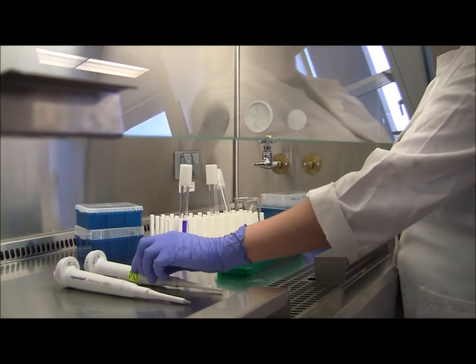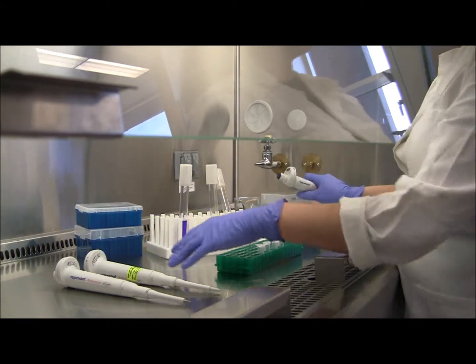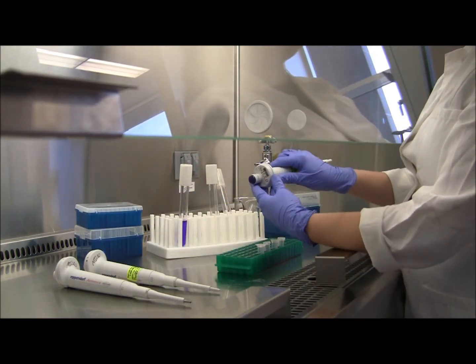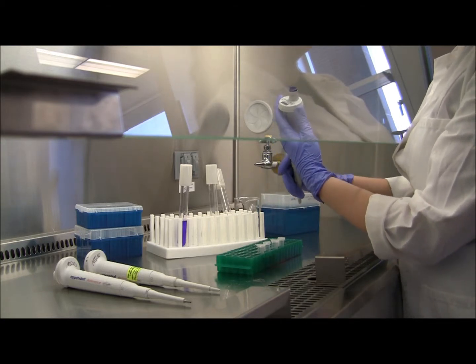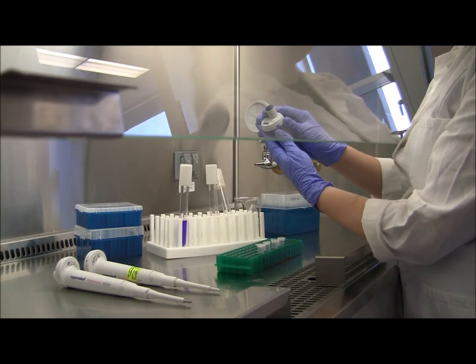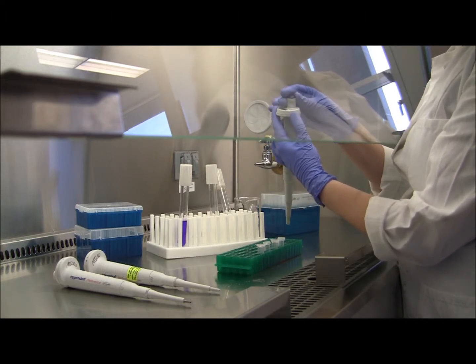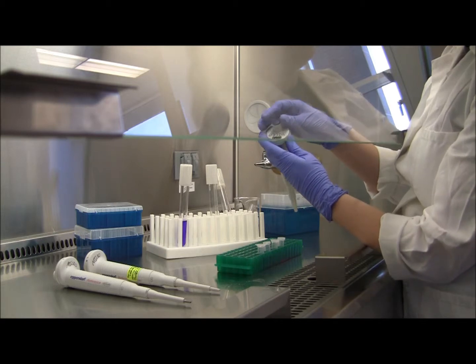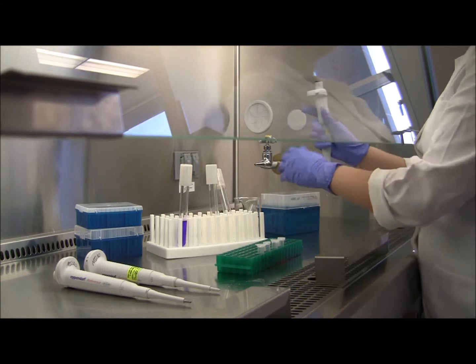There are three sizes of pipettes that we can be working with. Each of them comes with their own size tips, but for now we're going to be using the 1000 microliter pipetter. When you want to set your pipette for the amount of volume that you need, you're going to press in the blue button located on the side of the pipetter, and then rotate the plunger until the numbers read the volume that you want to pipette. Here we're going to do 500 microliters.